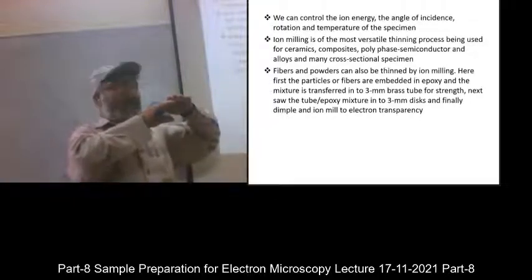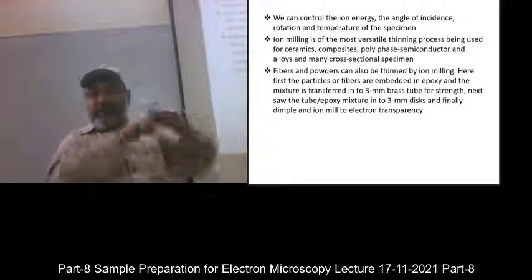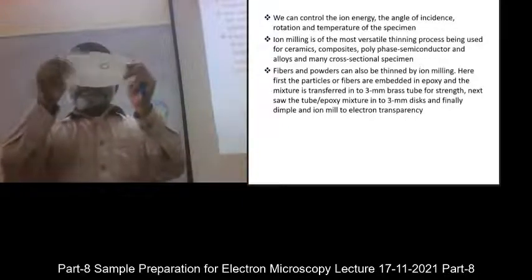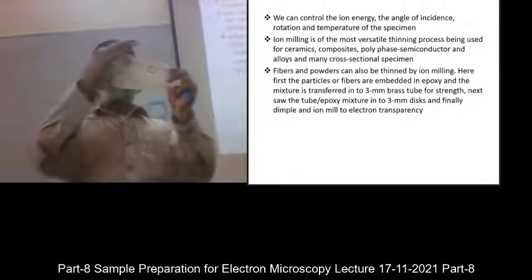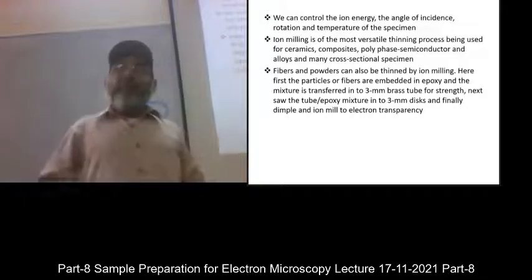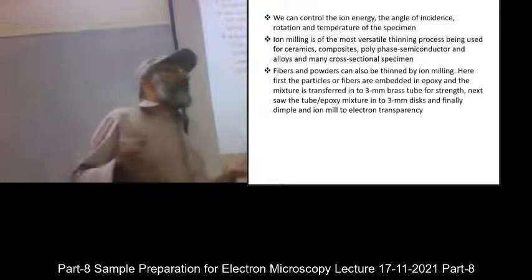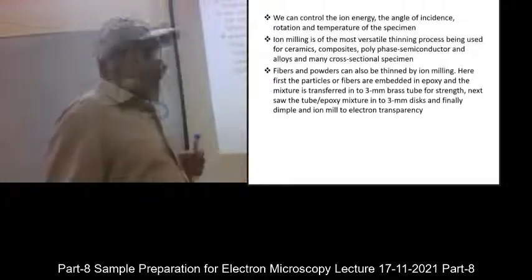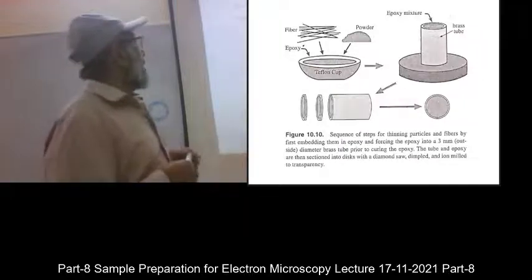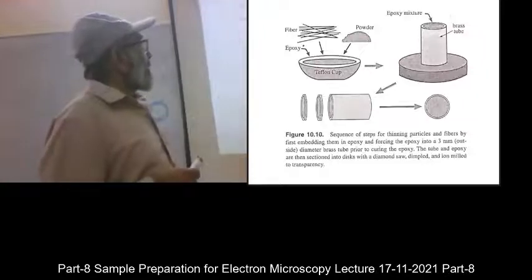Follow that? Yes. Those powder particles will be thin. It became like this. You made a piece, and when you grind it, the epoxy is holding the powder particles, and you are thinning them and dealing with it as if it is a self-supporting sample. Yes. These are fibers, and there are powders.